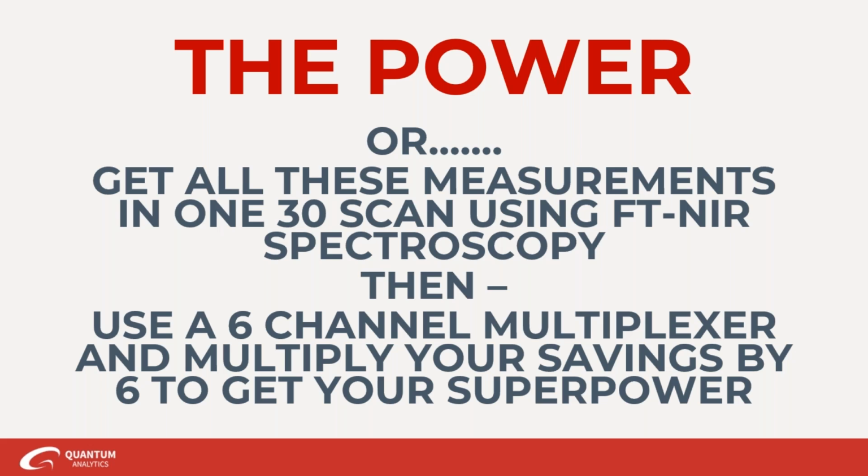Yes. So, another question, I think this might be the last question we have time for. Can NIR be used to measure particle size in the suspension polymerization process? Yes, particle size could definitely be measured by near-infrared spectroscopy. So get away from the polymers for a second, because there's another project that I worked on fairly recently.